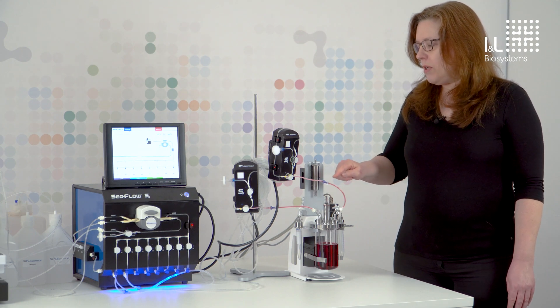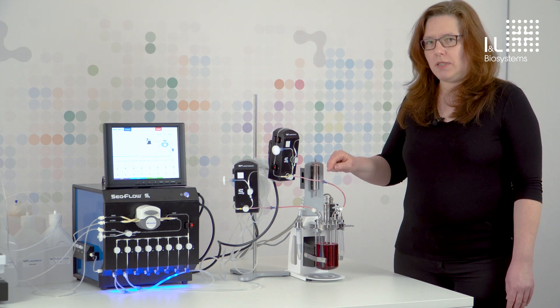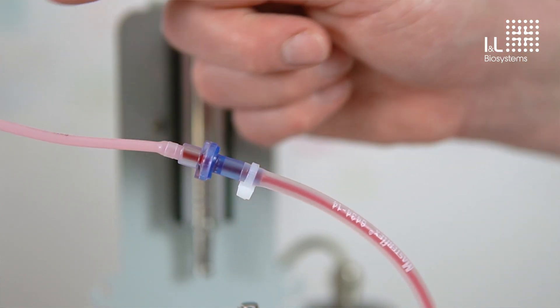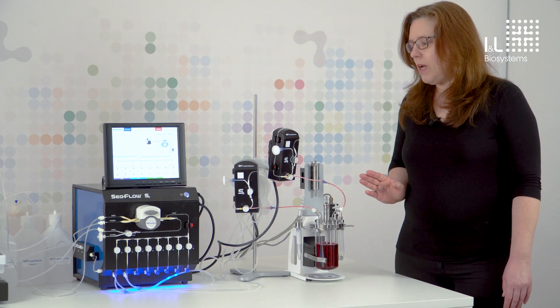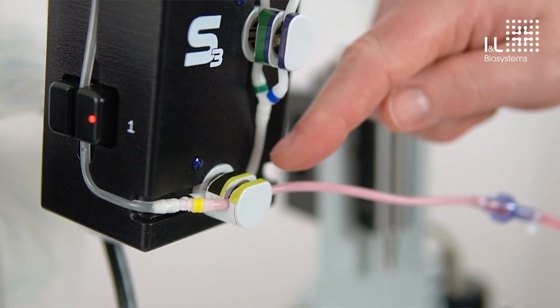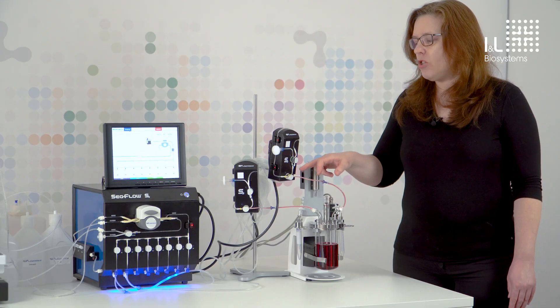When the sample is drawn, it runs through these blue check valves, so in case any pressure conditions are not correct, the liquid is never pushed back to the fermenter. That means it's always only one direction away from the fermenter. Here we have a clamp valve on this small module located near the fermenter to close the dip tube.